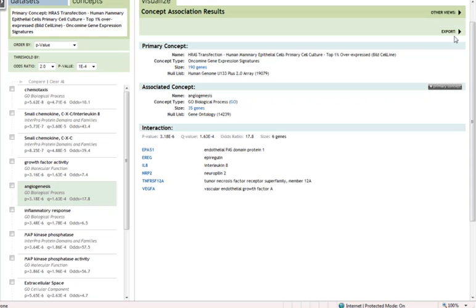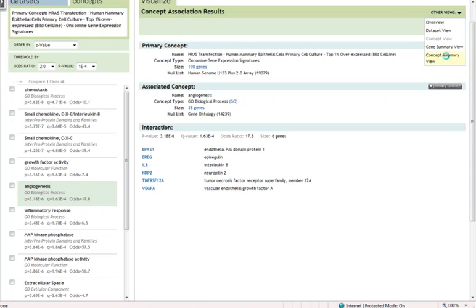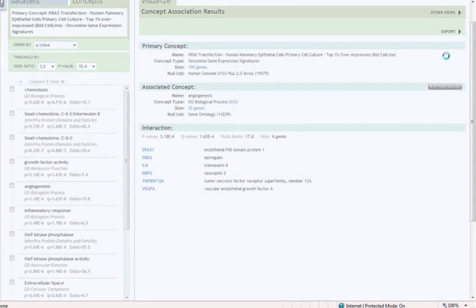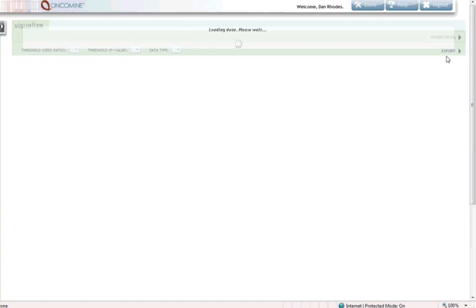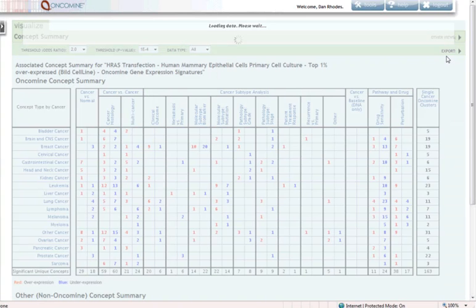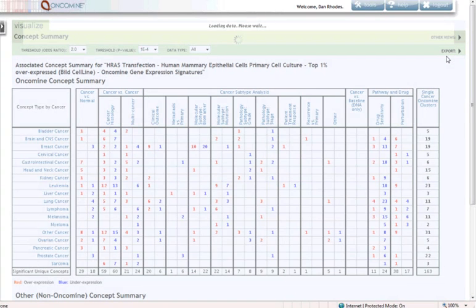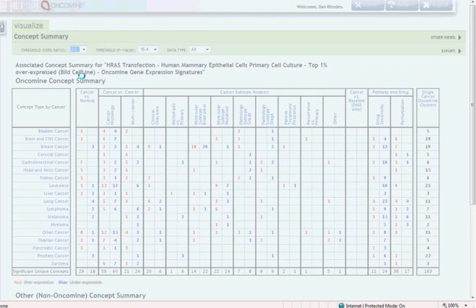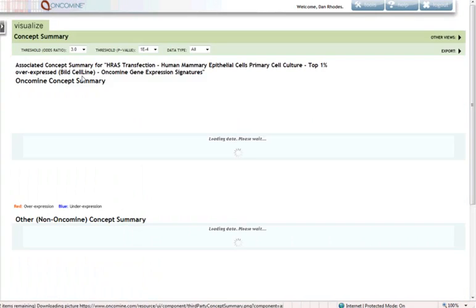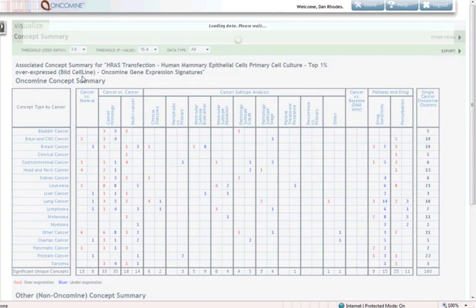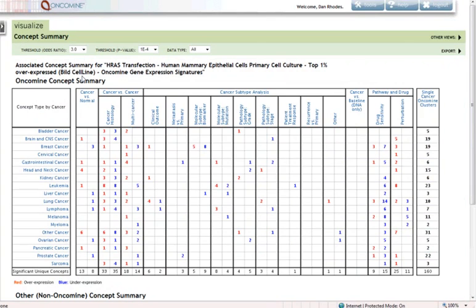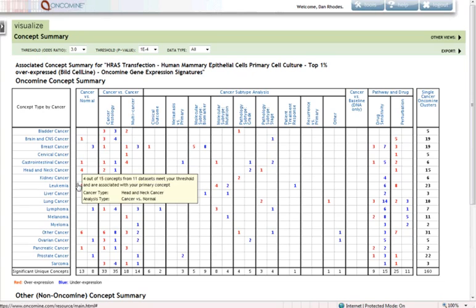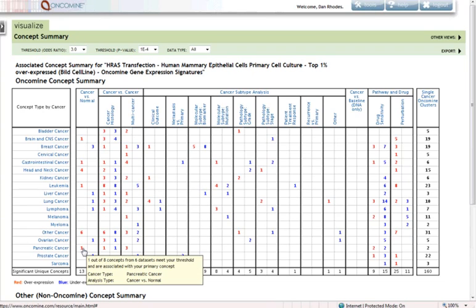Let's jump back to the summary and look at a couple of Oncomine-related questions about the RAS pathway. Again, notice that we have controls up here on the top. I'm going to up my odds ratio threshold to pare down the number of results. You notice we had a great number of results at an odds ratio of two. Odds ratio of three, which basically means there's three times more genes overlapping our RAS signature and signatures in Oncomine.